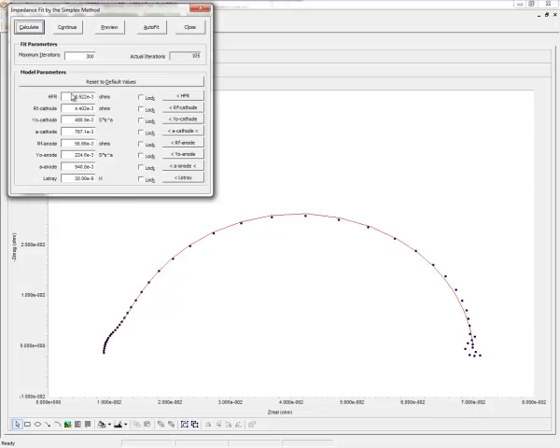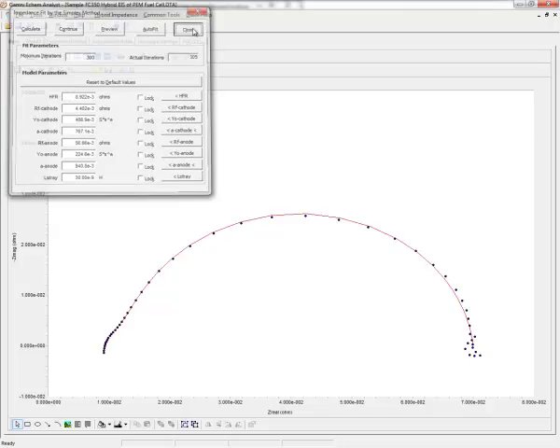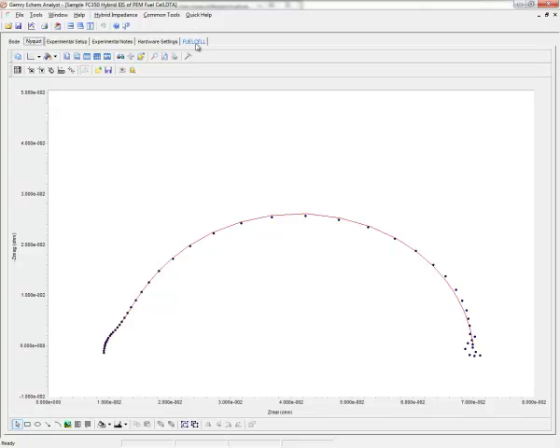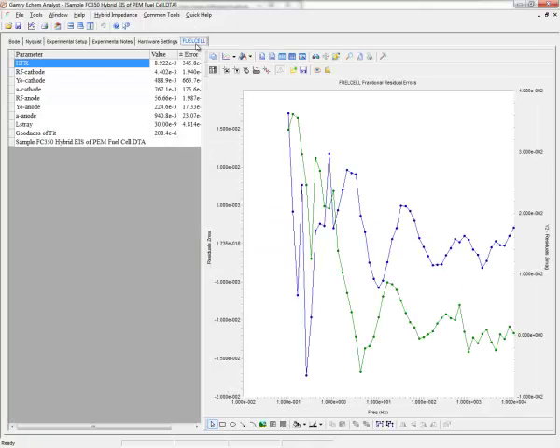I click Calculate a few times until I see that these values are no longer changing significantly. I will click Close, and I can see that a new tab has been added with values for each of those parameters, along with some error and residuals.